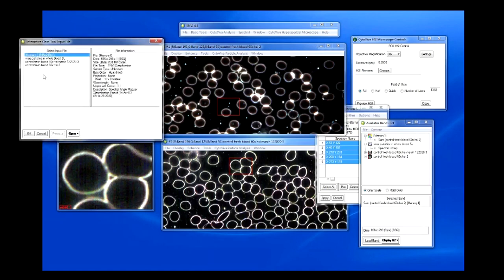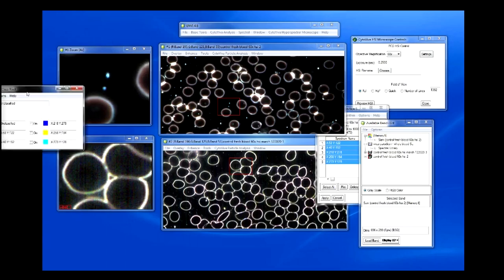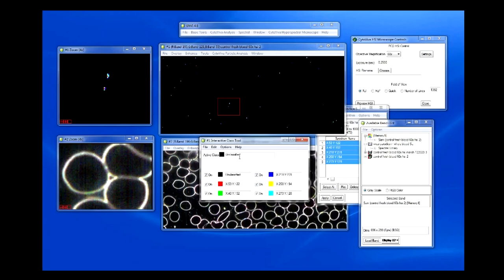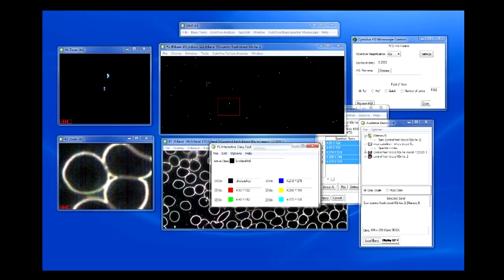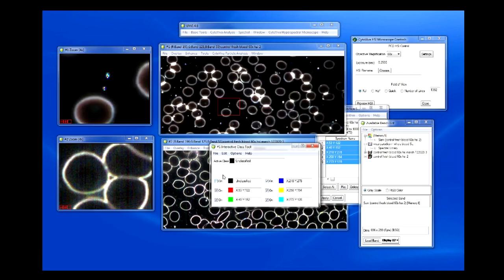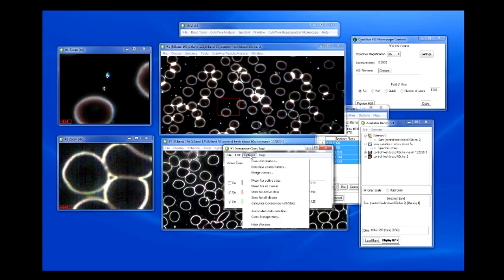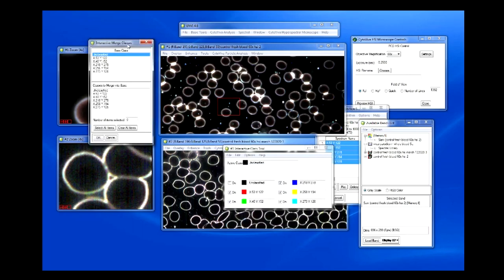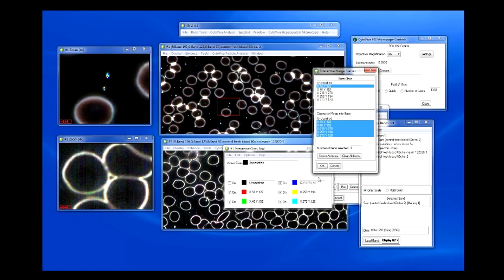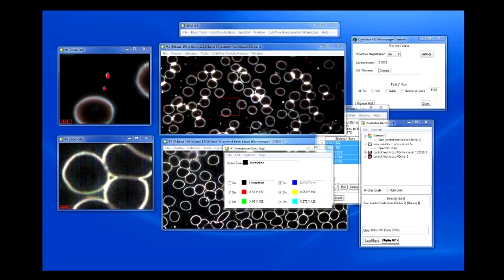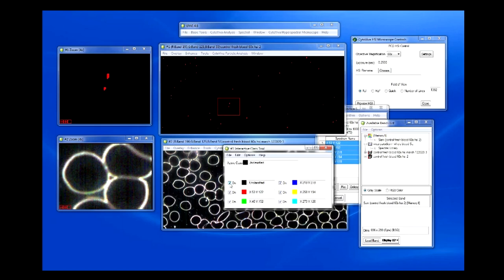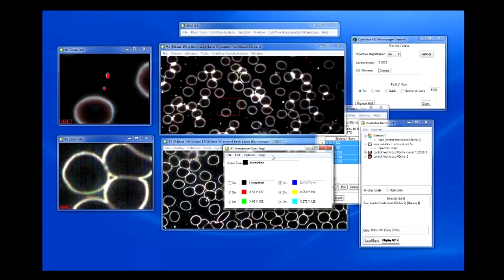We take the resulting classification file and overlay it onto the image. All pixels whose spectrum matches the virus spectrum filtered against the negative control are mapped. We can merge classes to make all the mapping appear red, giving a better ability to see those areas. Toggling the classification on and off shows clearly where the virus particles are mapped in the image.